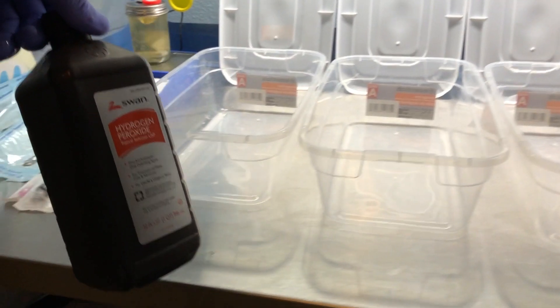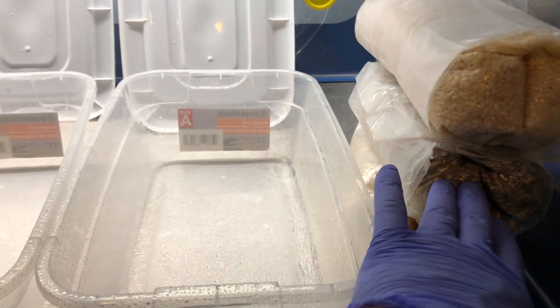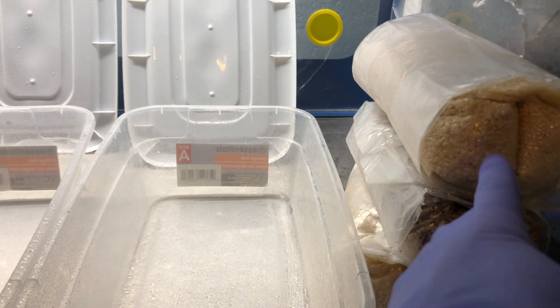I'm first gonna start off by cleaning out these totes. I like to use hydrogen peroxide initially, so that's gonna really lift up any dirt or particles that might be inside these totes. That's a 3% hydrogen peroxide, so I'm just gonna let that soak in for a minute. While that's soaking in, I can go over my rice and my oats — these are at 40% moisture content, so I just prepare them like I normally do.